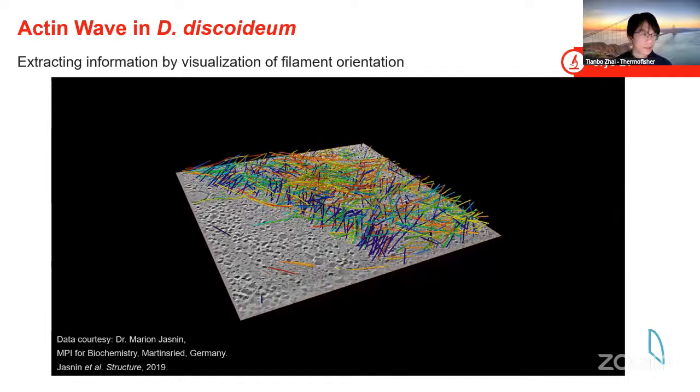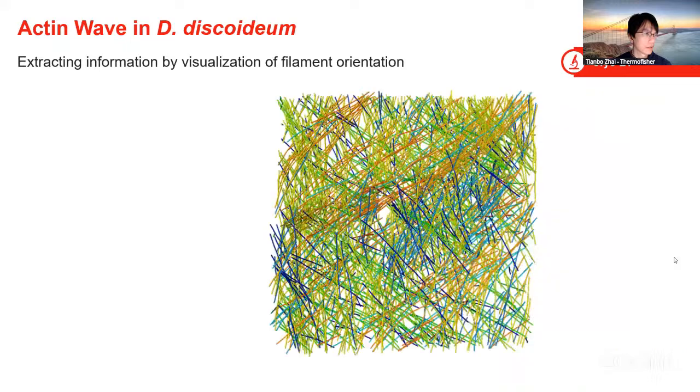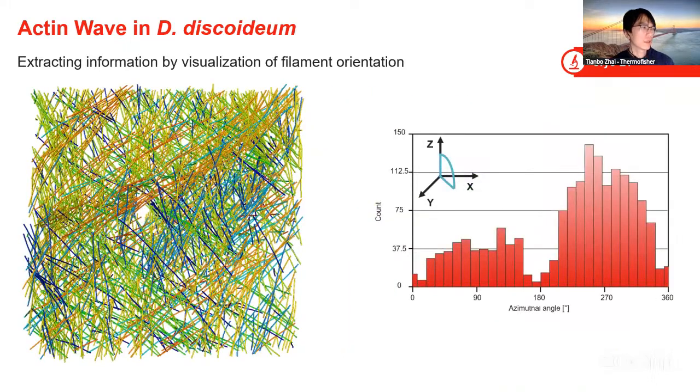Going to the next, of course, for all those parameters or measurements of interest, you can plot those histogram style statistics right away inside AMIRA, and you always get the option to export those in, for example, CSV format, and then you can post-process your data however you would like. It's just that inside AMIRA, there are some options available for you to extract everything inside the software.